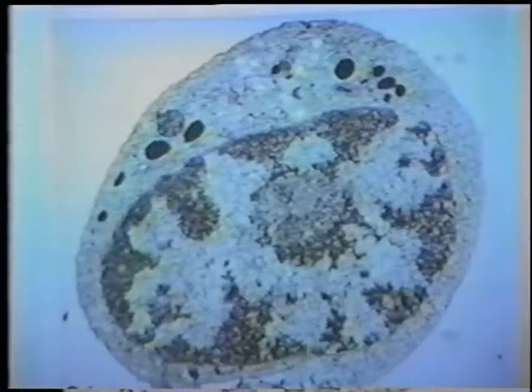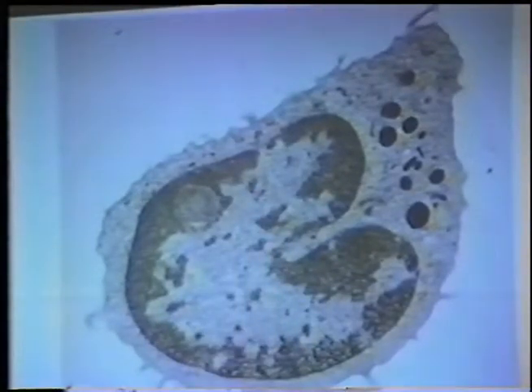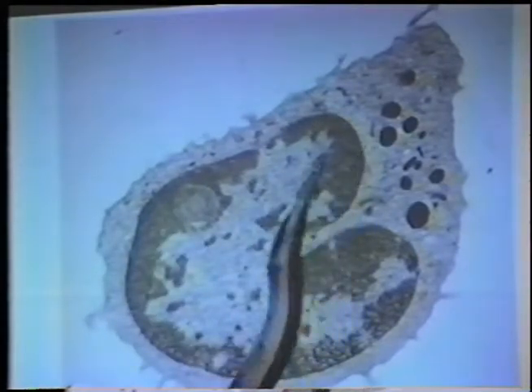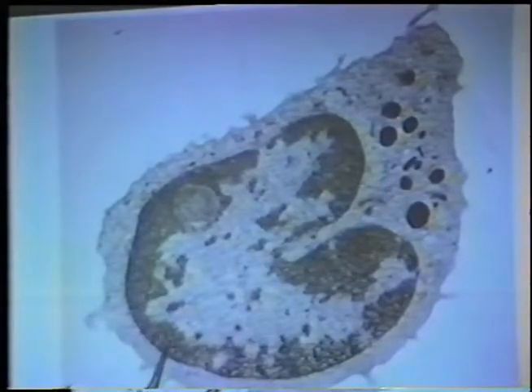Here you can see small areas of eutectic. The freezing wasn't so bad here that there are large bands, but there are small areas of segregation, which you can see in the cytoplasm. Okay, this is a rat lymphocyte, or these are rat lymphocytes. This cell was well preserved and then freeze-dried. And even in this cell, where preservation is overall very good indeed, even in the nucleus, you can begin to see some slight arborization toward this side of the cell, indicative of slight ice crystal damage, a gradient of freezing.